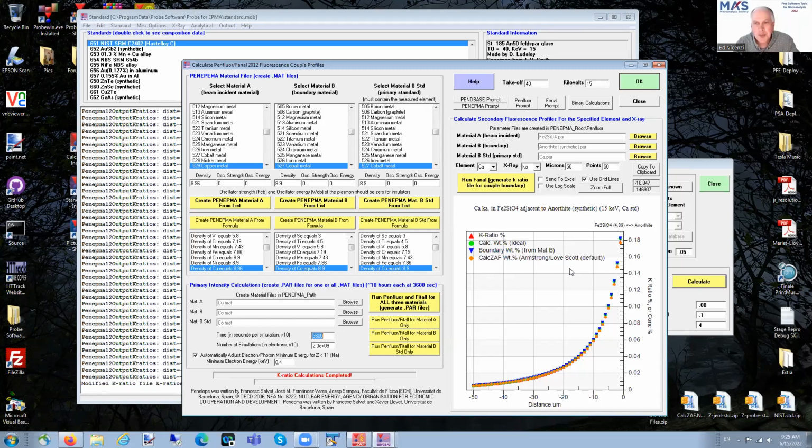Thank you, Ed. Makes me wonder if this type of effect is even considered in complex materials where you're doing micro-XRF, where you might get equivalent. Yeah, I mean, micro-XRF is a very sensitive technique. Yeah. Okay.